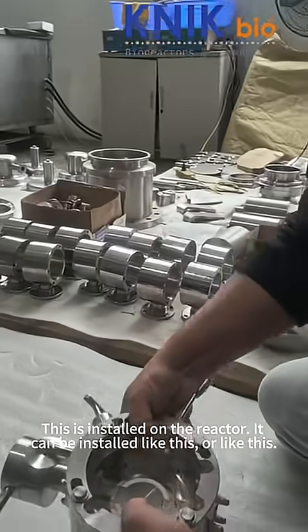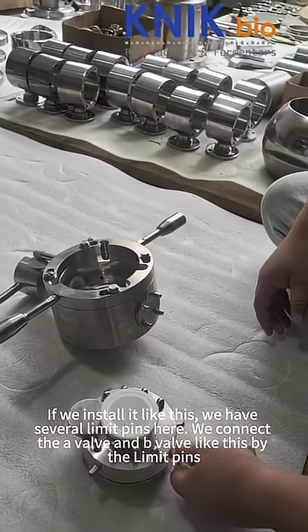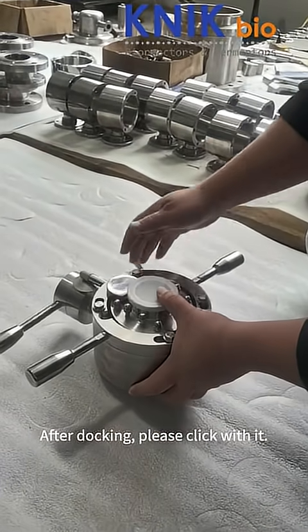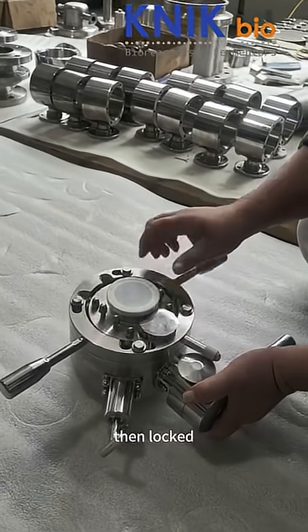It can be installed like this, or like this. If we install it like this, we have several limit pins here. We connect the A valve and B valve like this by the limit pins. After docking, please click with it. Then locked.